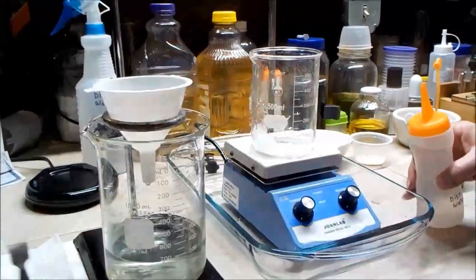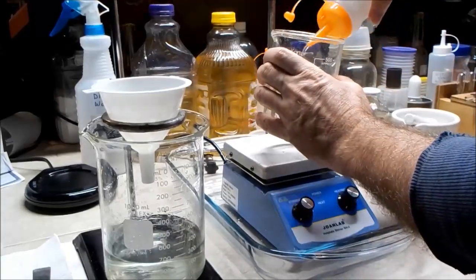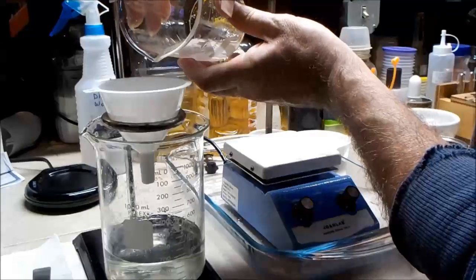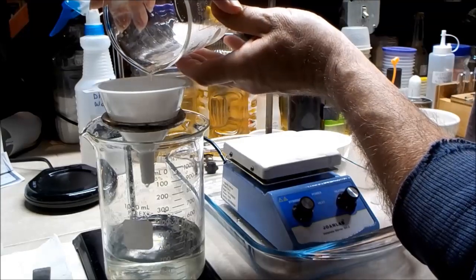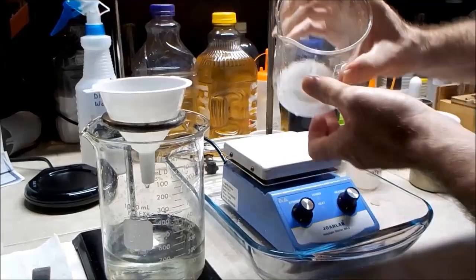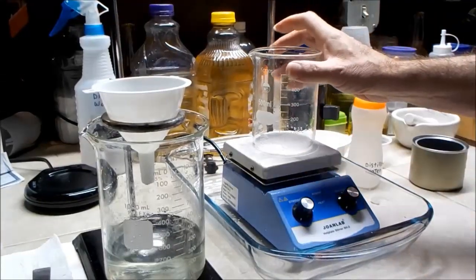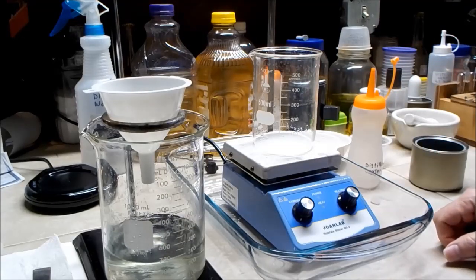I'm going to rinse that with some ice-cold water. Then I'm going to re-dissolve that in a little bit of water, pour it out in a dish, and let it evaporate slowly to see if I can get some larger crystals.